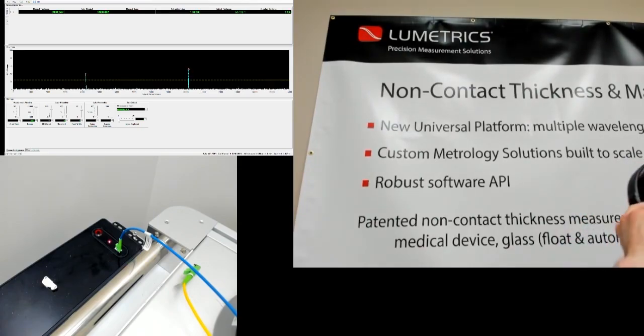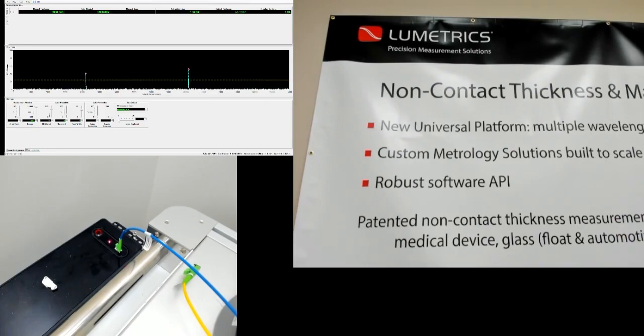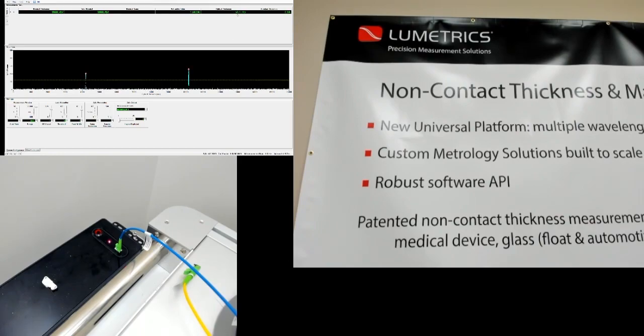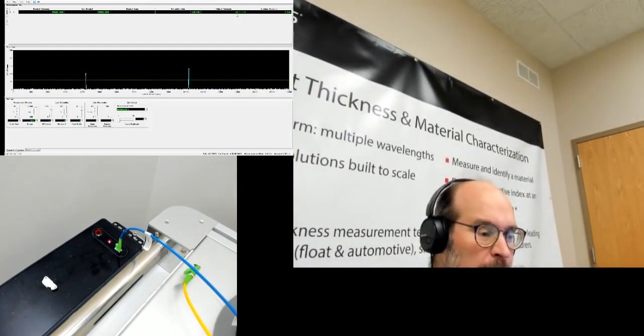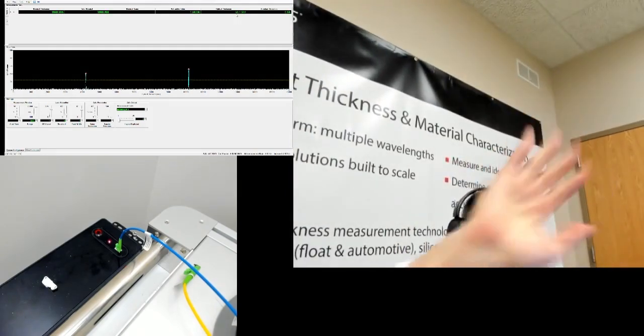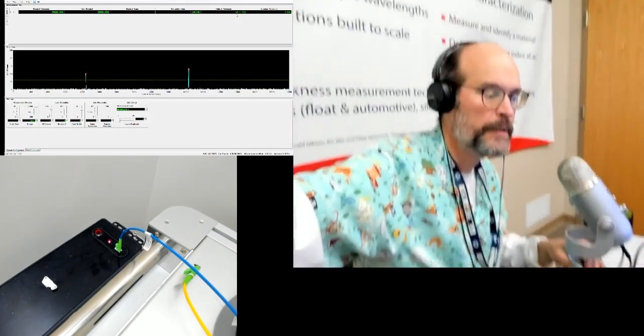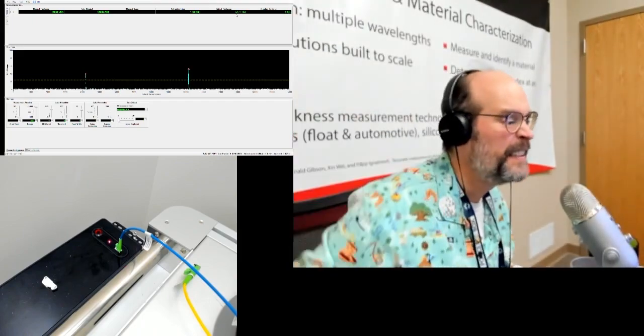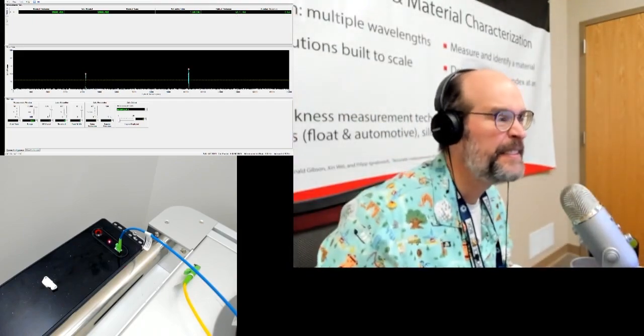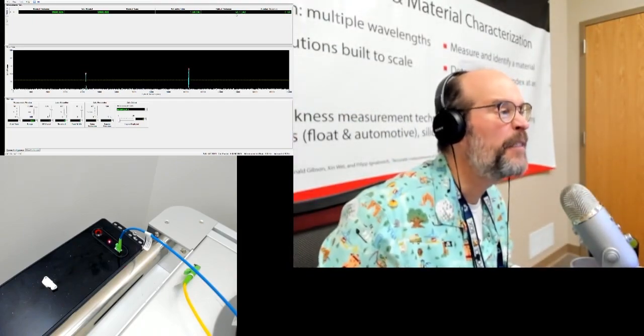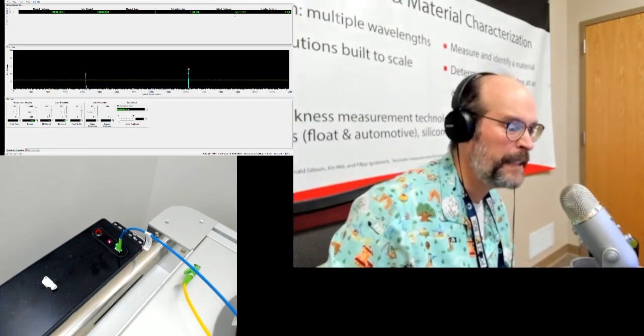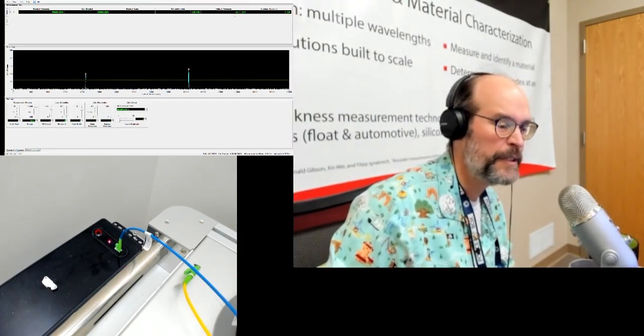And we now have an optical thickness reading. Let me get the cursor in here. So this optical thickness reading is what you're going to compare to the certificate.